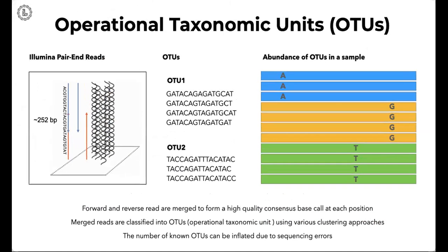When you have 16S rRNA amplicon sequencing data, the sequence reads can still contain variation, right? We don't know whether the variation present in the reads is attributable to significant biological variation, or to technical variation due to noise in the data recording. So instead of looking at reads individually, which is the usual approach in other omics data types, in metagenomics data analysis we cluster these reads into several clusters.